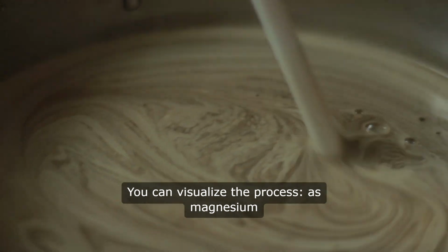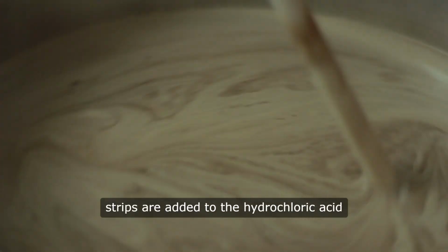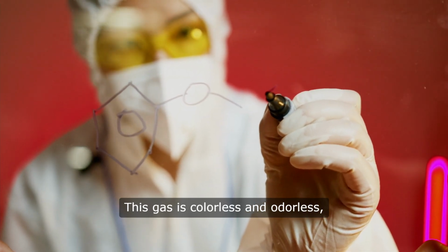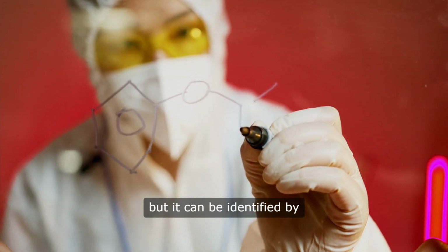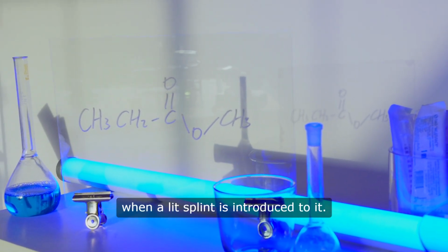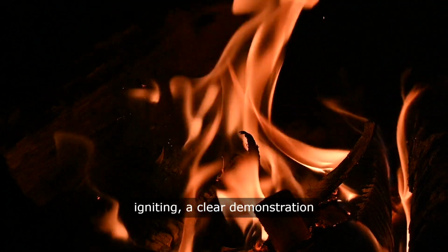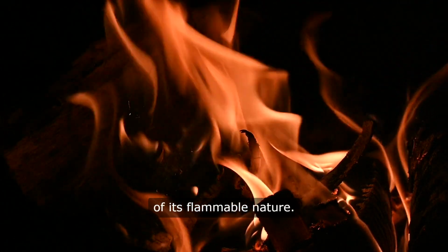You can visualize the process. As magnesium strips are added to the hydrochloric acid solution, you'll notice effervescence, or bubbling, which is indicative of hydrogen gas being released. This gas is colorless and odorless, but it can be identified by its characteristic pop sound when a lit splint is introduced to it. This sound is a result of the hydrogen gas igniting, a clear demonstration of its flammable nature.